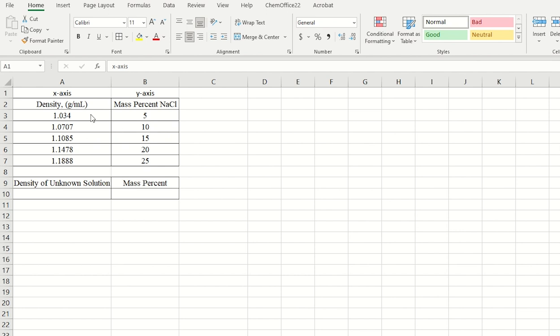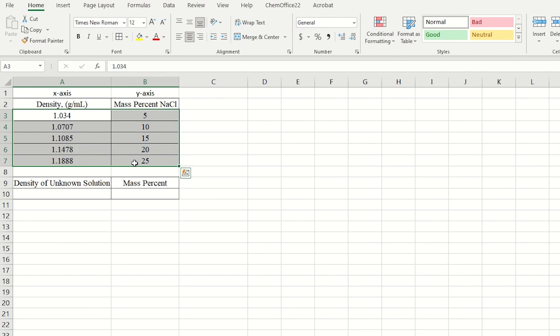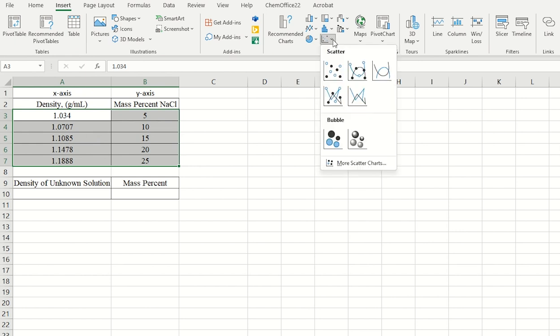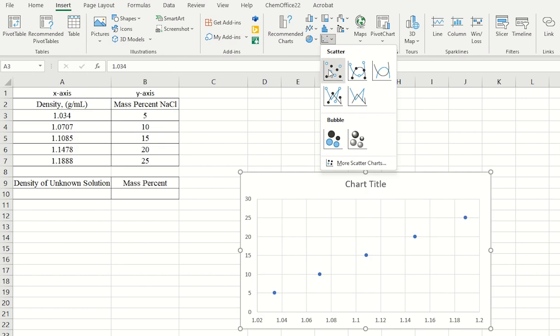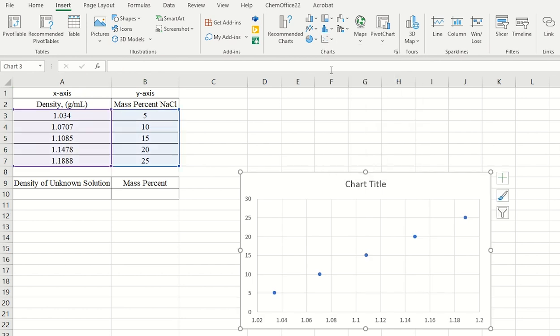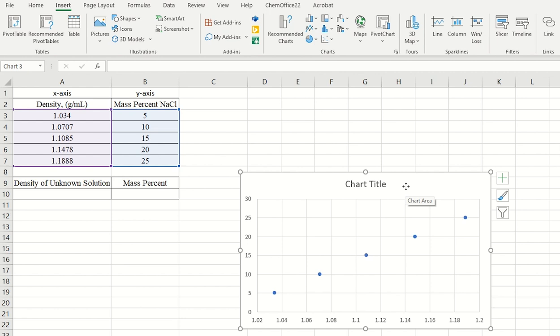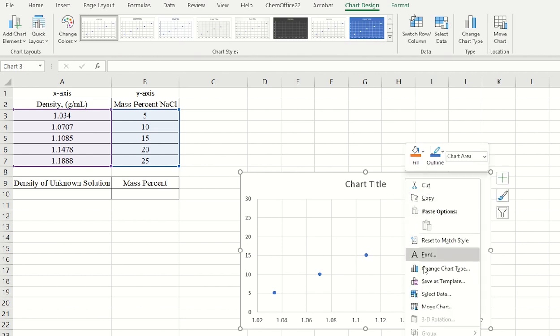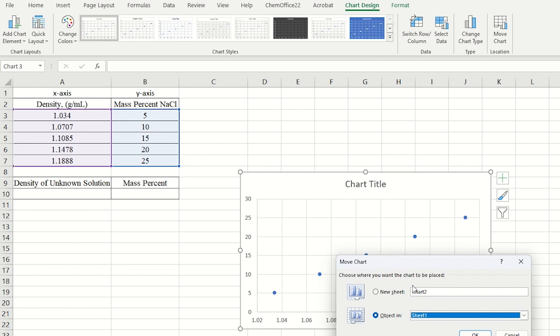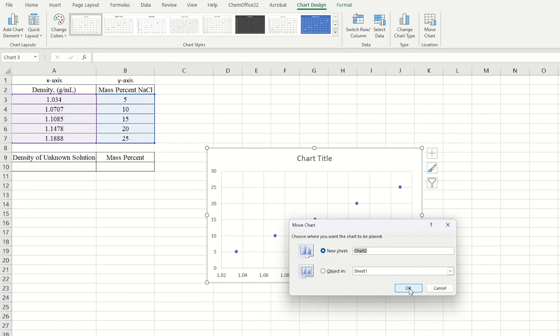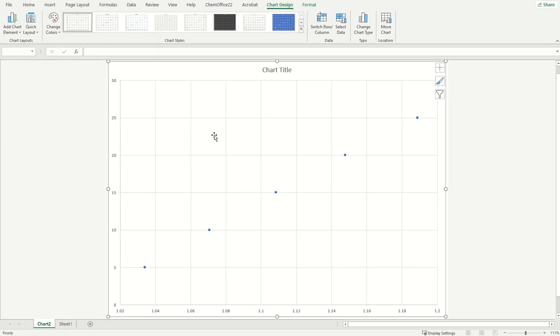Let's highlight both columns, and I'll go up to insert, and we'll go ahead and plot our chart. We'll use the x-y scatter, this button right here, and I'll go ahead and use this sample right here. So here's our chart. I'll go ahead and move this, I'll right-click, and we'll move the chart to its own sheet, that way we can see it a little bit better.